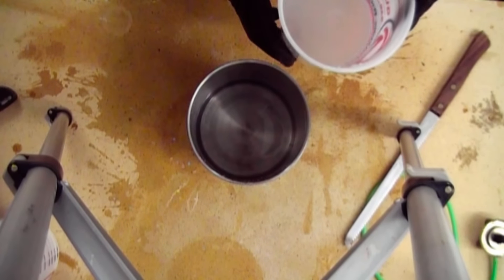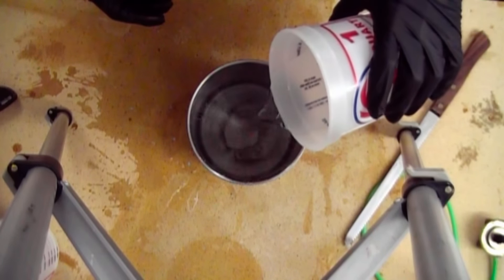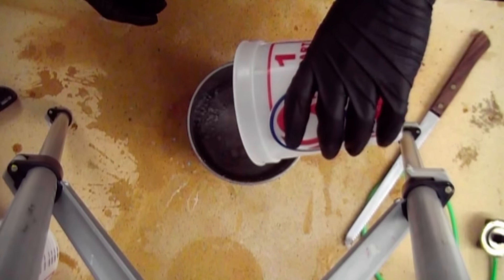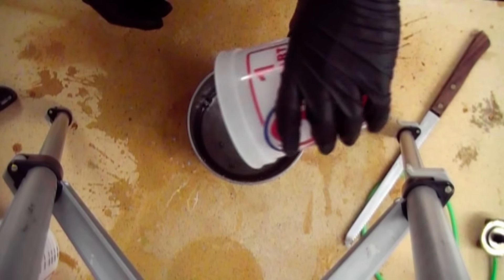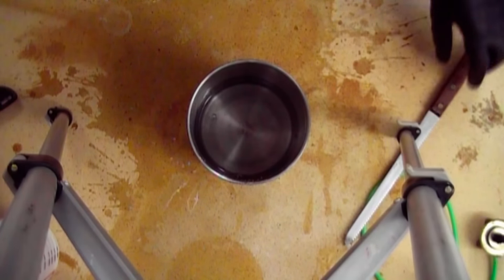I've chosen to use a stainless steel vessel to mix this in. Pyrex glass would have been ideal, but I don't have any. A regular glass jar will not work because it can't take the heat.